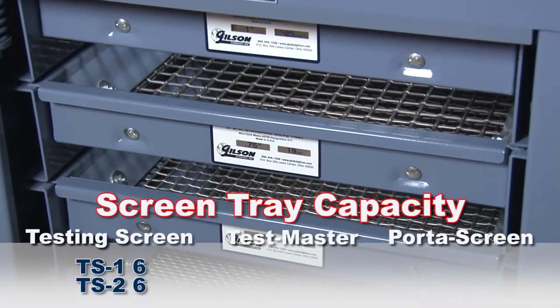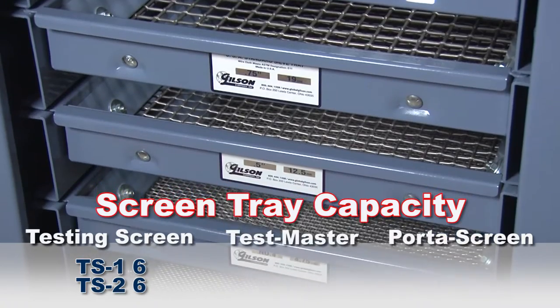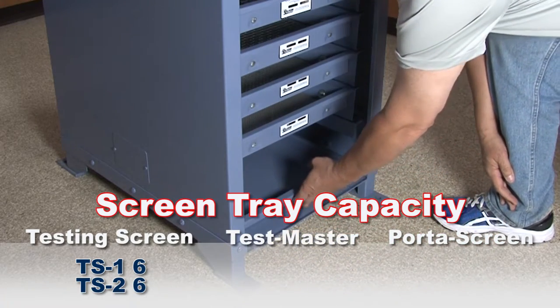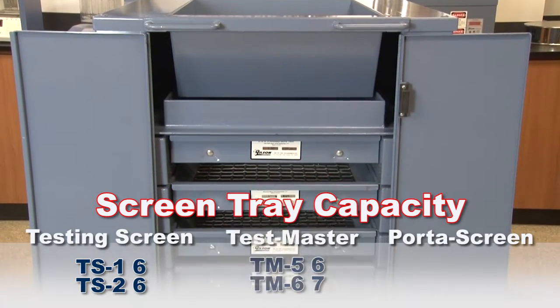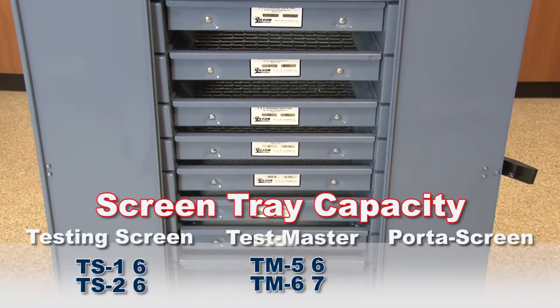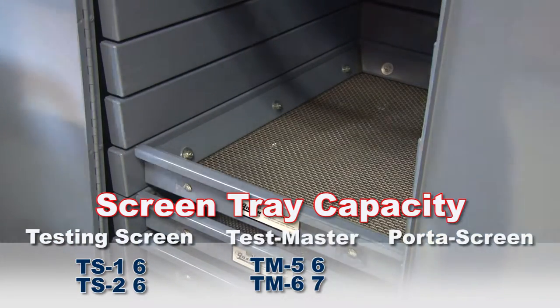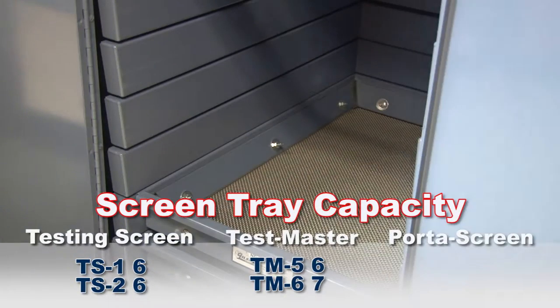The TS1 and TS2 testing screens have six mounting slots, and the dustpan can be placed on the bottom shelf, freeing up one of the slots for an additional screen tray. The TM5 accepts six screen trays whereas the TM6 has a seven tray capacity, and both units have a wider tray spacing which is ideal for samples with larger particle sizes for more efficient agitation.